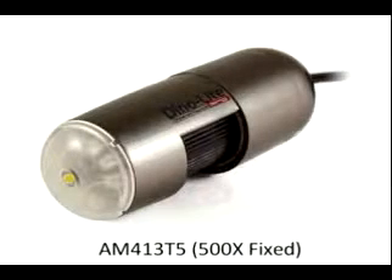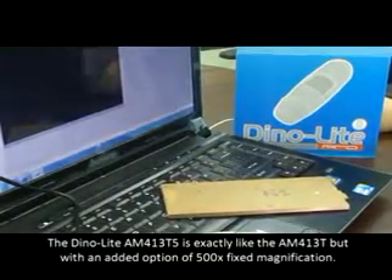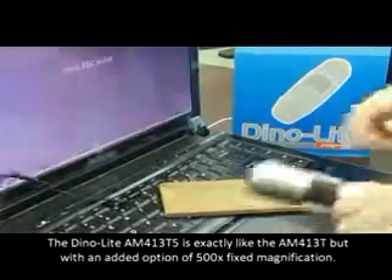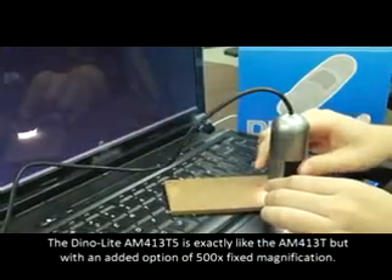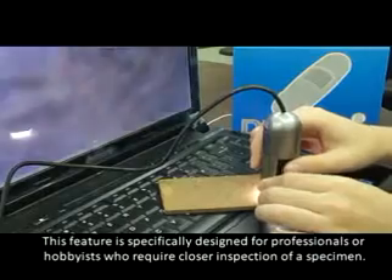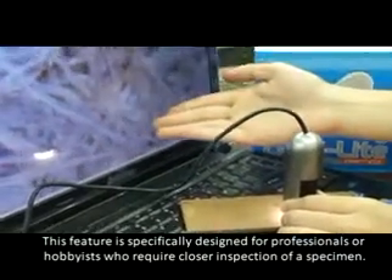The AM413T5 provides high resolution, professional tools, ease of use, and flexibility for the user. The DinoLite AM413T5 is exactly like the AM413T, but with an added option of 500 times fixed magnification. This feature is specifically designed for professionals or hobbyists who require closer inspection of a specimen.